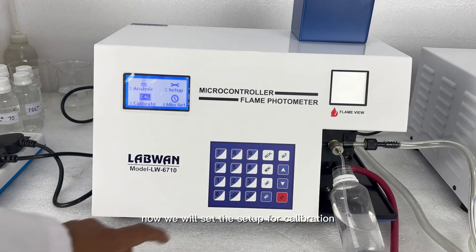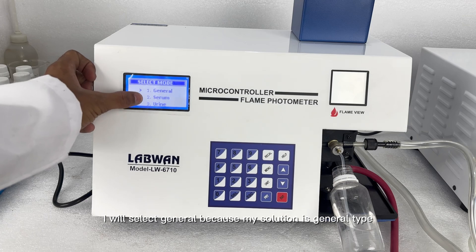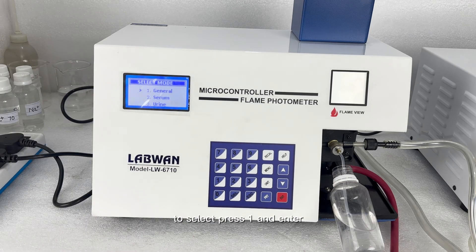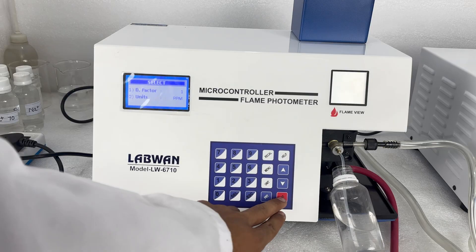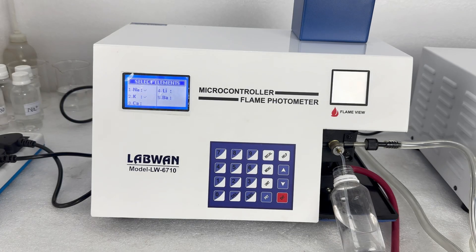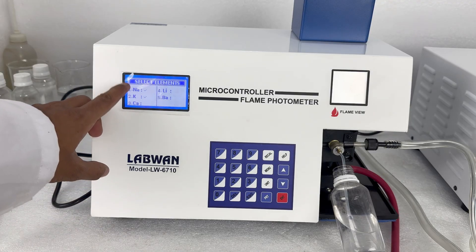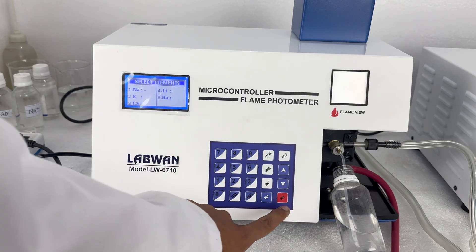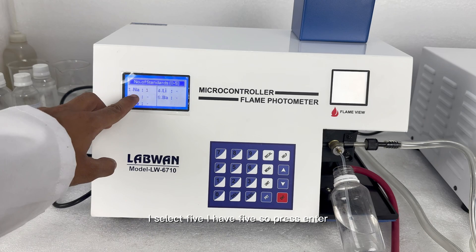Now we will set the setup for calibration. Press 2 for setup. Now we have to select — I am selecting 1 here. Now I have to select the mode; I will select general because my solution is general type. To select, press 1 and enter. Now press enter to skip this value. Now you have to select your solution type or element — here I select Na by pressing 1. Now I have to select the number of standard solutions; I select 5, so press enter.